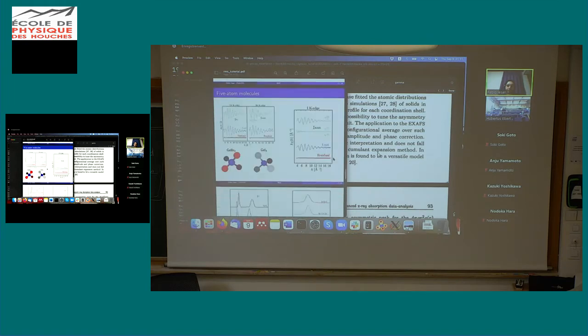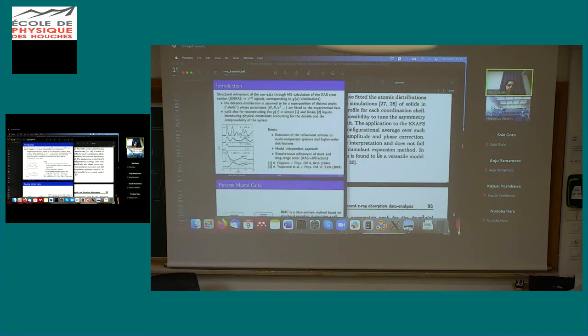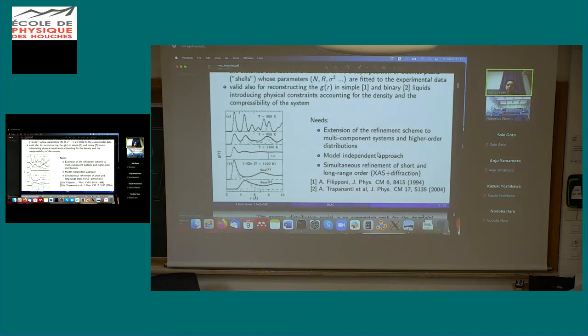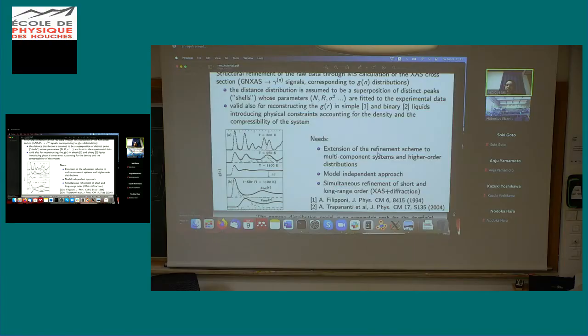So I will talk later, but the first slide that I showed is one that Andrea also showed this morning. The pair distribution function for a system is described by these peaks, no? If you have a crystal system, for crystal you can use the Gaussian function, but for high temperature or disordered systems, you see it's highly distorted, so we use this gamma distribution.